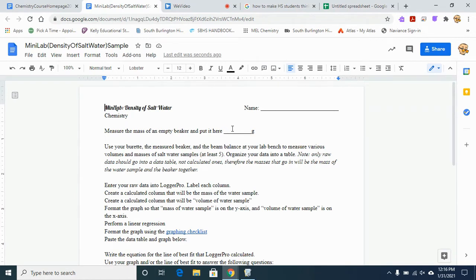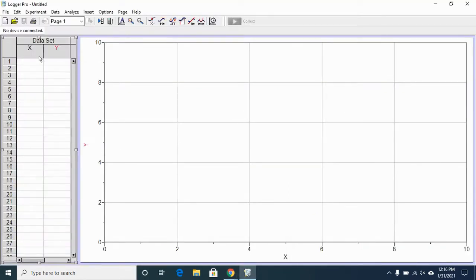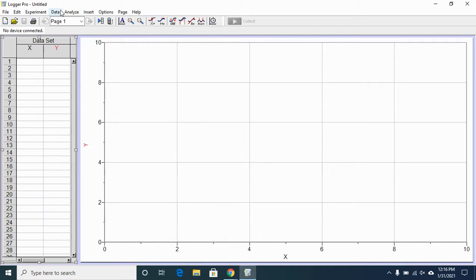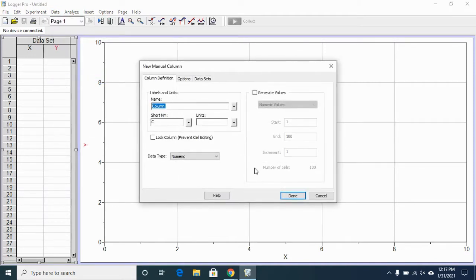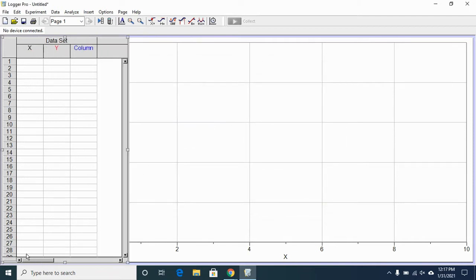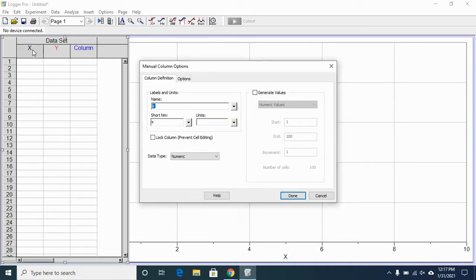Measure the mass of an empty beaker and put it here. Mine was 44.631 grams. Next, I'm going to input my data into Logger Pro. I performed five trials and there were three pieces of data recorded for each trial. So in addition to the X and Y provided, I'm going to need to add another manual column. You do that by going to data at the top and new manual column. I'll name it later. A manual column means that you're going to be typing in numerical data and not a calculated column, which we'll look at later where it's going to calculate values for you.